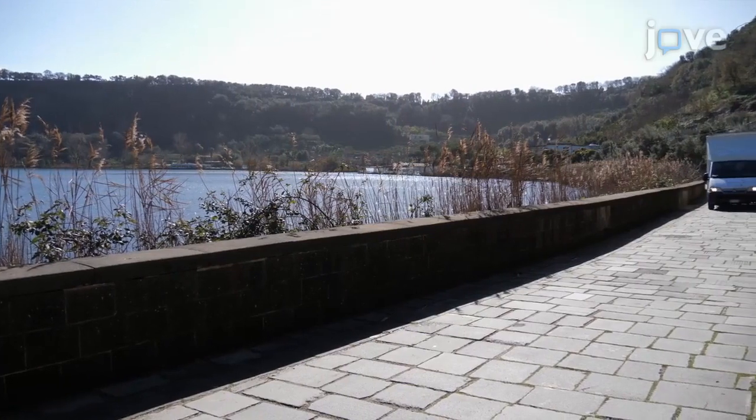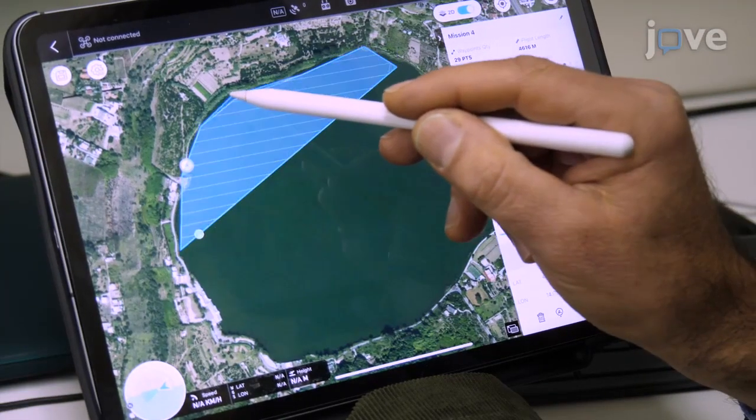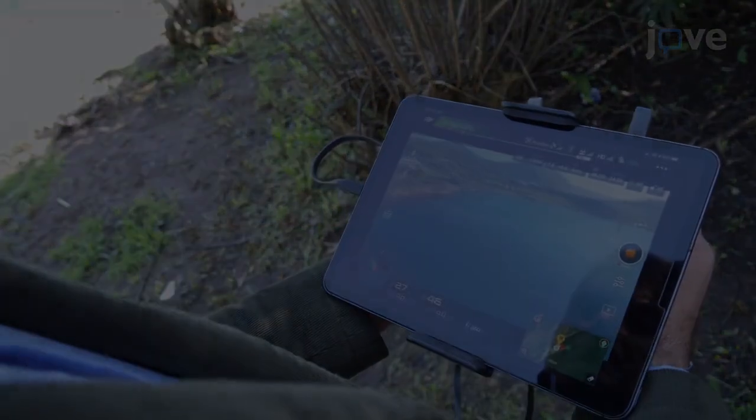For sample collection, transport the equipment to the selected sampling site in the mobile lab and plan the drone flight path for performing a macro area survey. At the site, use several drones.